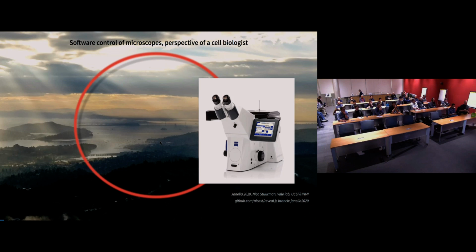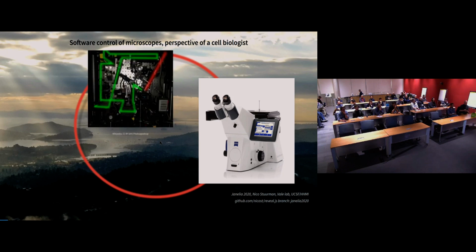But on the other hand, we have microscope developers, and there are quite a few amongst us here, who develop things like, well, this is an image of a lattice light sheet microscope, but you can replace this with any cool advanced system that, just by virtue of being experimental systems developed in the lab, do not have an easily accessible software interface.